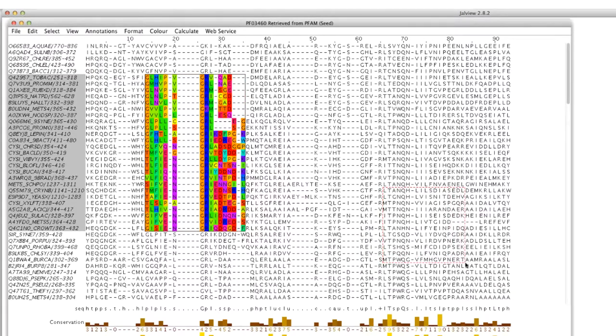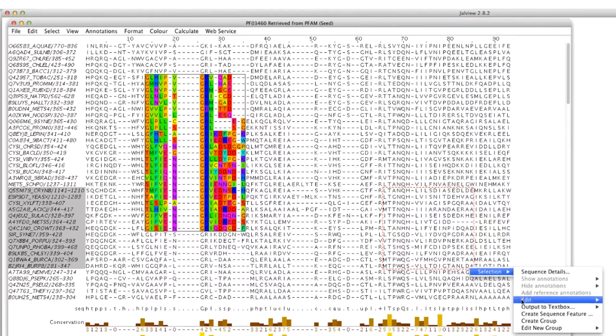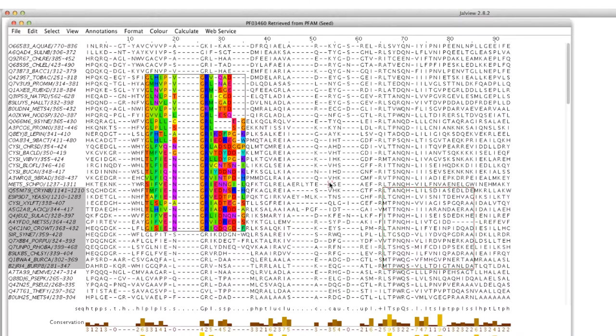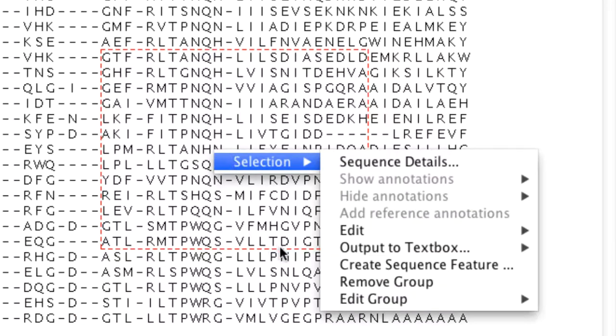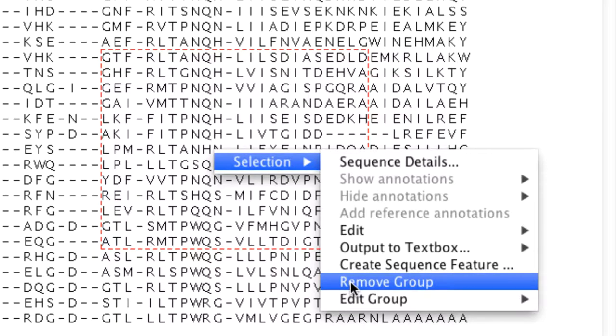Several groups can be created on a single sequence alignment. A group can be removed by selecting remove group in the selection menu.